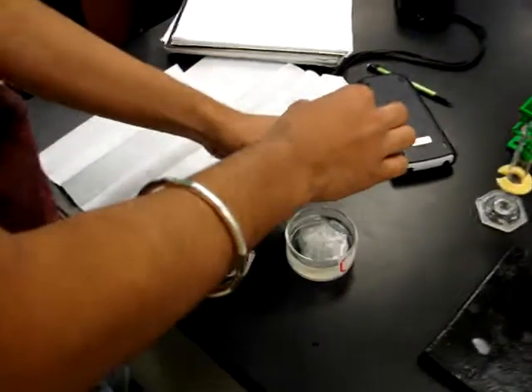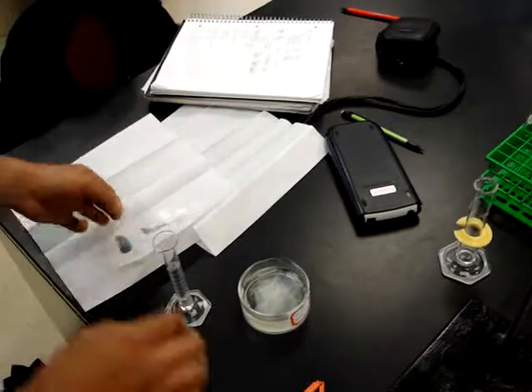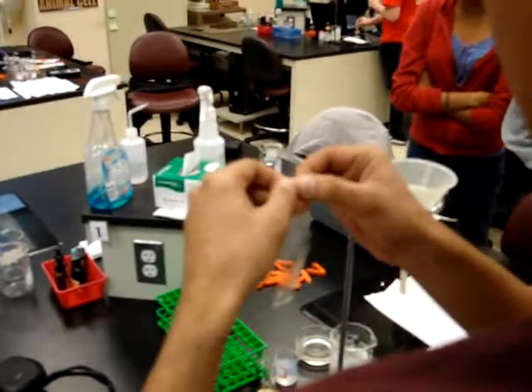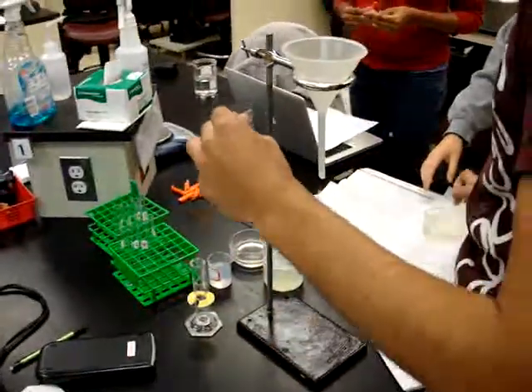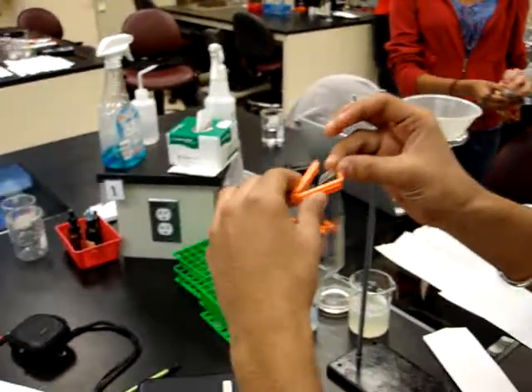Next, we're going to take out the dialysis tubing and soak it in water for 10 minutes. He's putting the clips on to secure the bag.